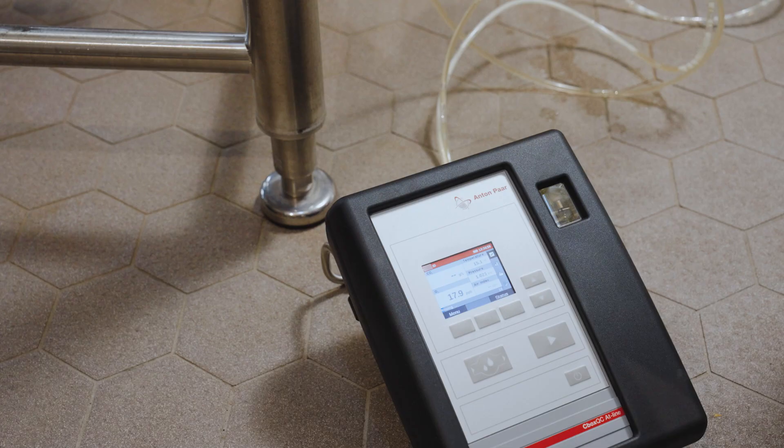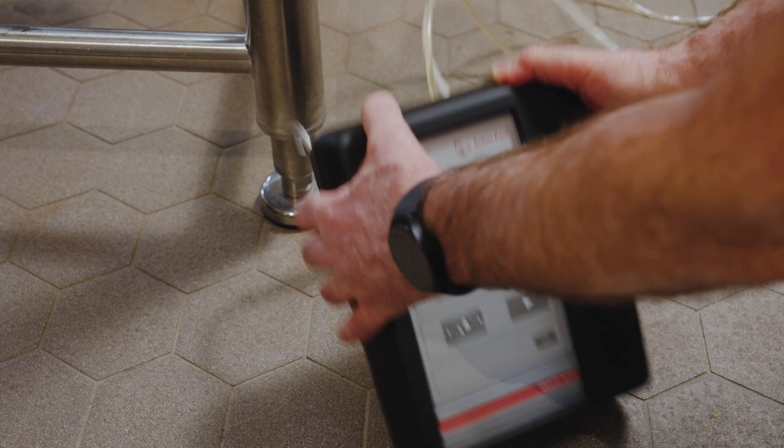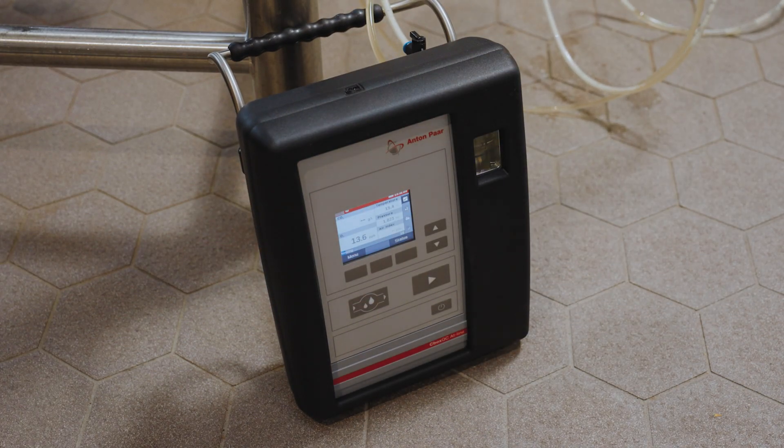If the tank or line pressure is low, around 1 bar, position the instrument upright and as low as possible to ensure bubble-free filling.